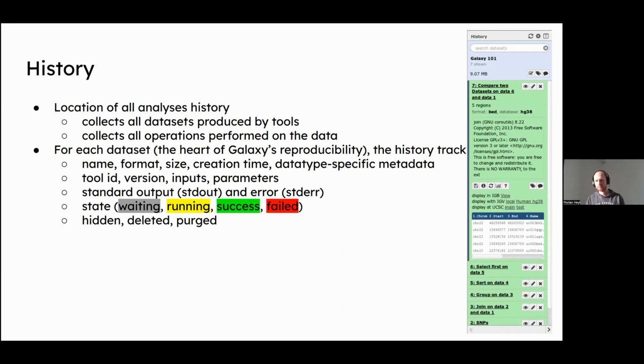Second, there is really a bug in the wrapper. Then you have to contact the Galaxy people if you work on public Galaxy instances, so that this wrapper is fixed. Or, if you're familiar with programming, you can also engage in the community and fix the error yourself.